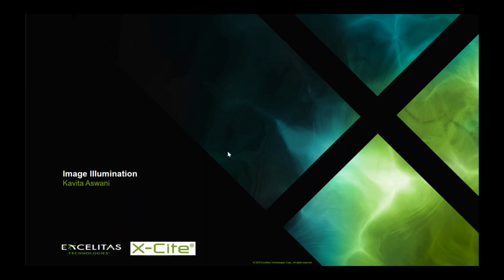As far as illumination is concerned, obviously that's important. You do need a good, stable, uniform illuminator in order to get data that is quantifiable and accurate. If you have uneven illumination, you'll have differences in intensity in your slide or in your tissue or even within a specific cell. So I just want to briefly introduce the X-Cite illuminators.